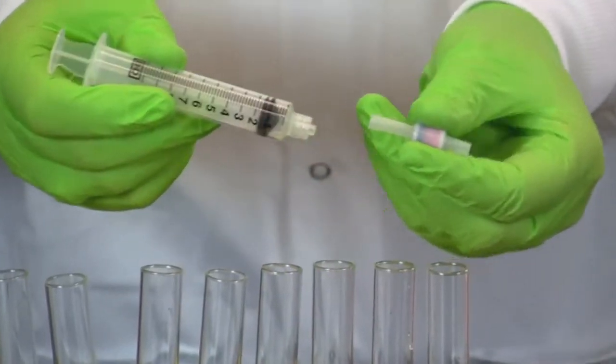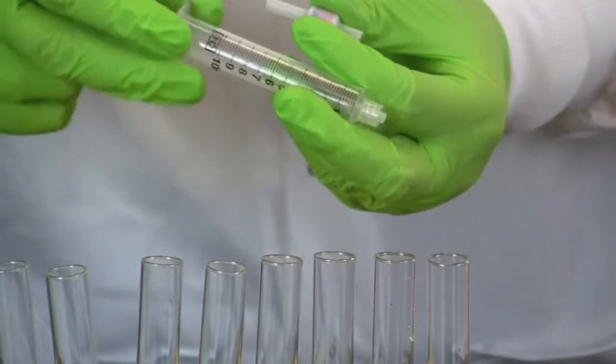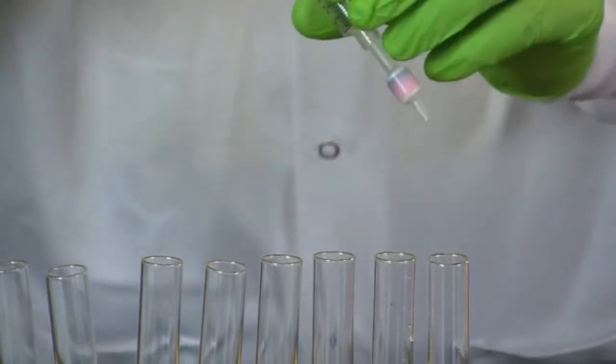Once the flow through is clear, remove the cartridge, pull out the plunger, and then reattach the cartridge to the syringe.